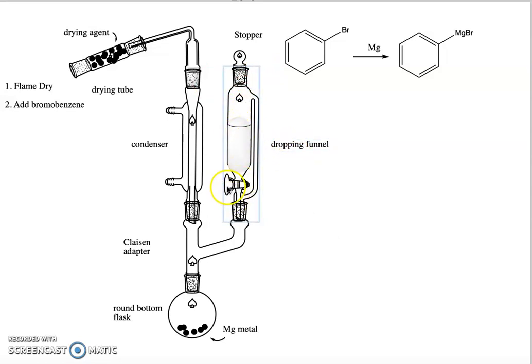Now the bromobenzene is in the dropping funnel. We open the stopcock here—it's actually already shown in the open position—and we let the bromobenzene drip slowly over the course of several minutes onto the magnesium metal.